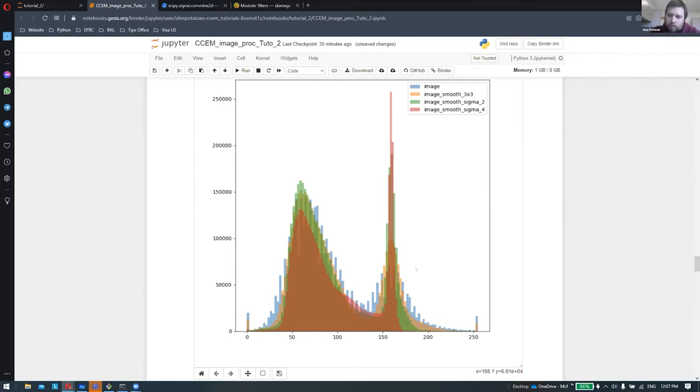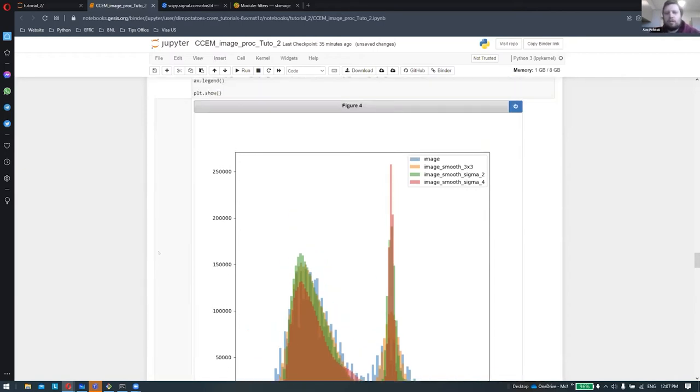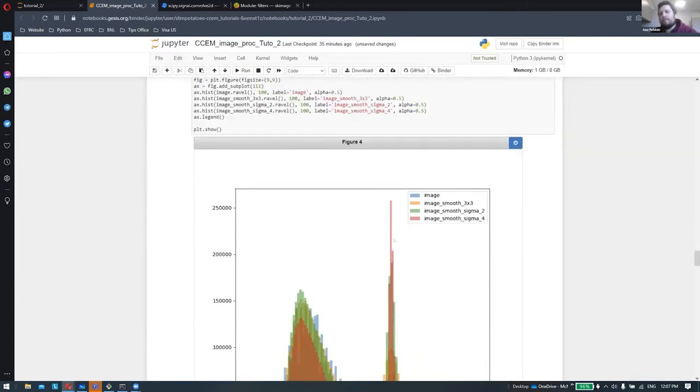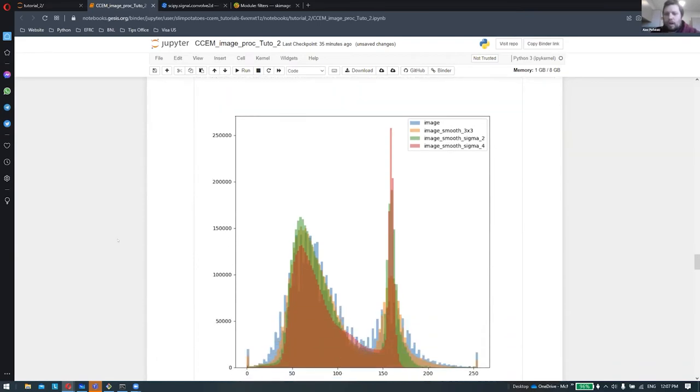On that histogram, you don't have the full story. You just have the intensity distribution over the different ranges. You don't see how degraded the quality of the image is. So this histogram should be paired with the blurriness of your image, as another characteristic. But we can see that something like sigma 1 or sigma 2 is already good enough to help in separating the data.